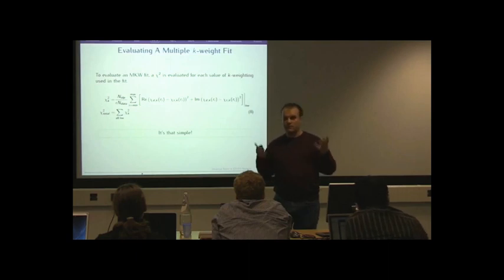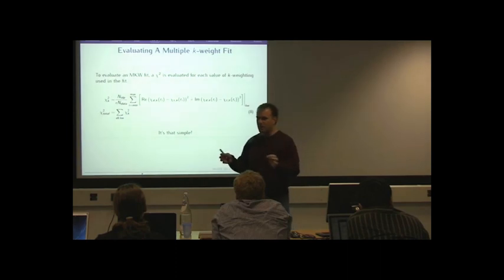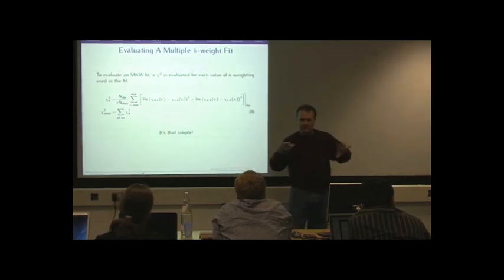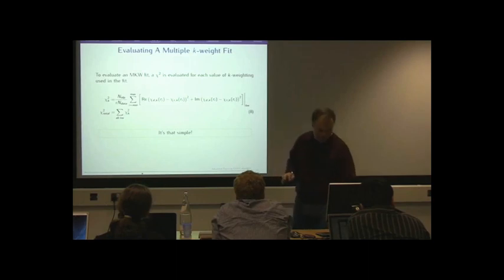But it gives us a better measure of all of our parameters, because it evaluates a thing that is sensitive to each of the parameters, and there's a term in there that then forces each of the parameters to be as good as it can possibly be. So here's an example of that in action.